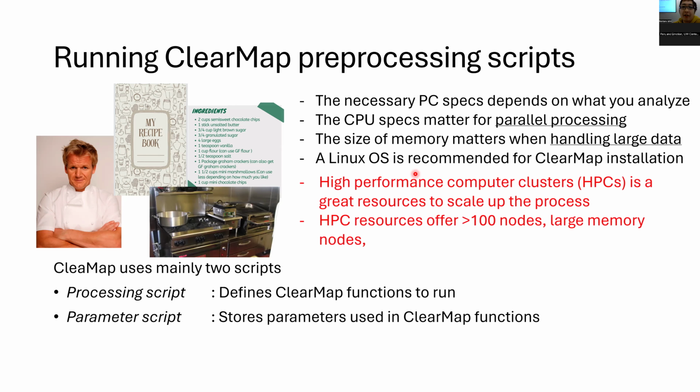The reason I recommend a high performance computer cluster is that it's actually really hard to make your kitchen. It is also very hard to change your kitchen once you've made one. So one day you might be just having mouse brains at 1.6x, but maybe your boss will come to you and ask you to start analyzing 3.6x rat brains.